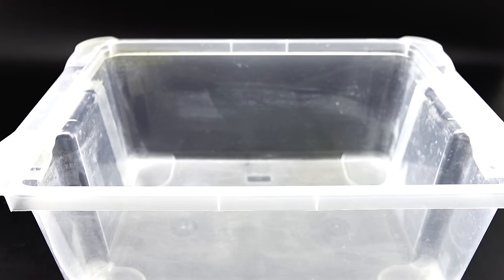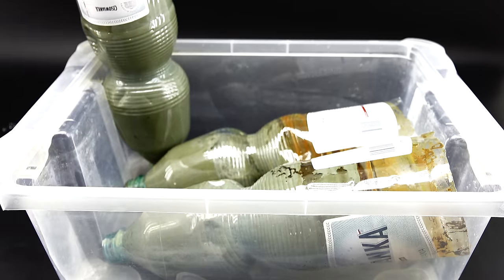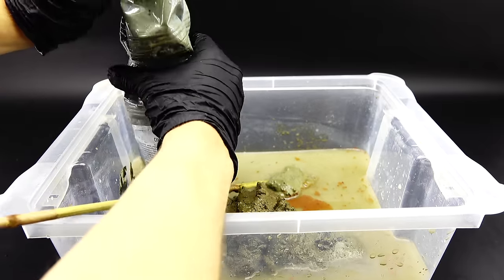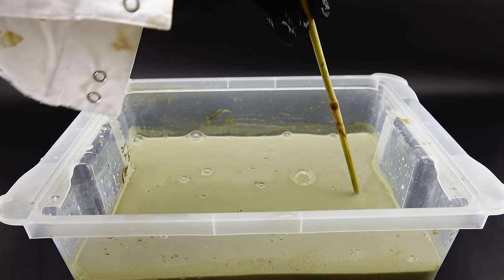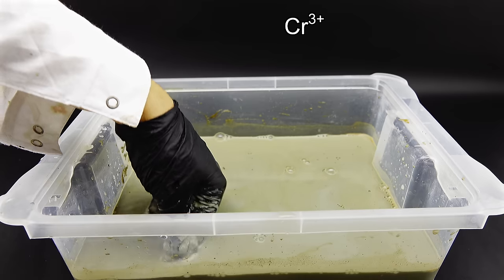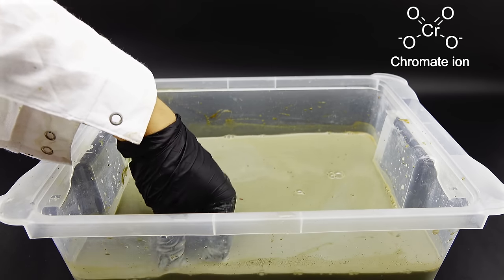After filtering probably over 5 liters of liquid, I was so fed up I decided to proceed further, even though there was still quite a bit of sodium sulfate contaminating my sludge. I used about 3 liters of distilled water to get the sludge out of the bottles. Now it is time to oxidize the chromium from the 3+ state it's currently in to its more dangerous and reactive +6 state, in the form of the chromate ion.